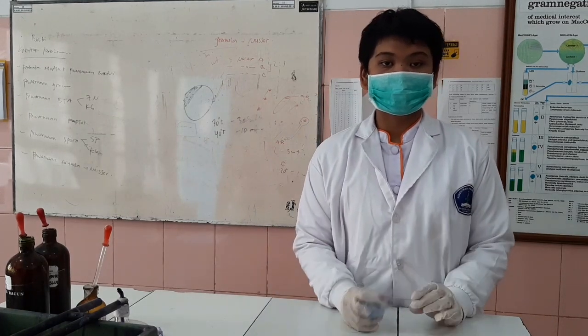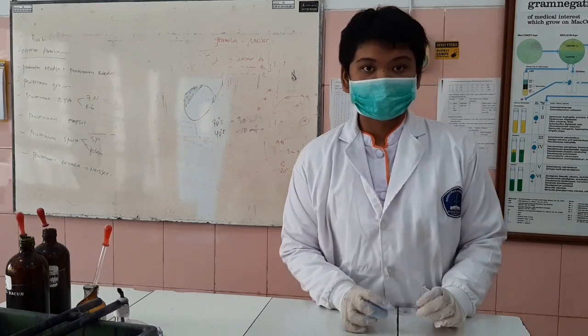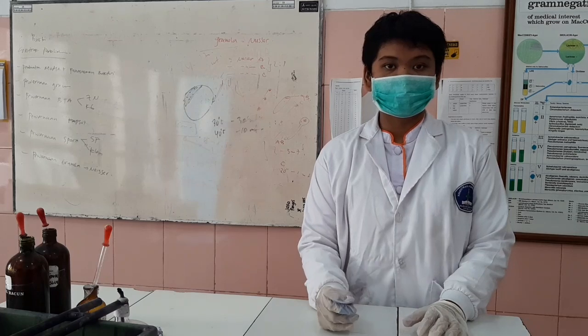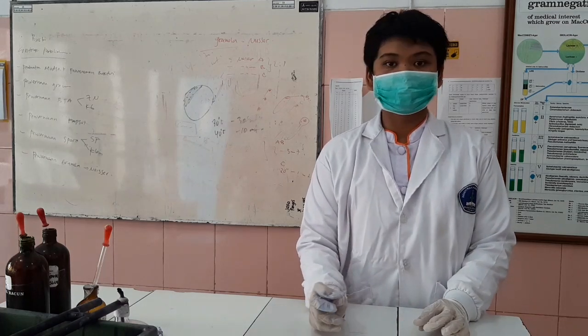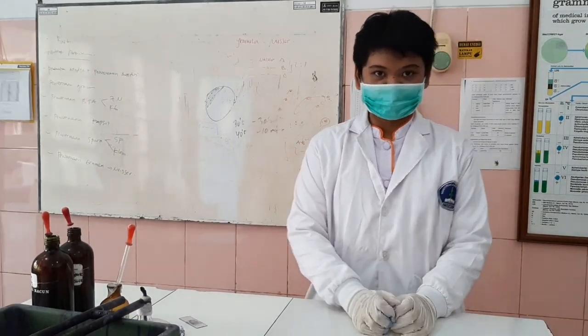Don't forget to drop oil emulsion before you observe the preparation in the microscope. Don't forget to clean all the materials. Thank you.